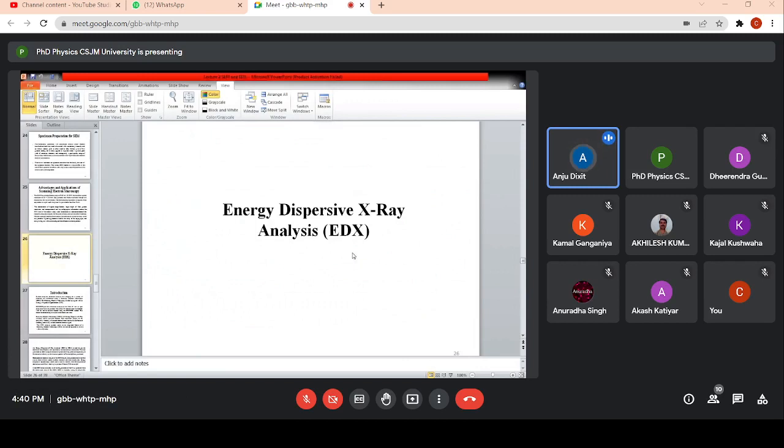Surface analysis, chemical analysis, and imaging on a variety of materials are performed using a scanning electron microscope. The scanning electron microscope is also equipped with an energy dispersive spectrometer. SEM EDS provides chemical analysis of the field of view or spot analysis of minute particles. More than 90 elements from the periodic table can be detected with a low atomic number detector using the SEM EDS method.